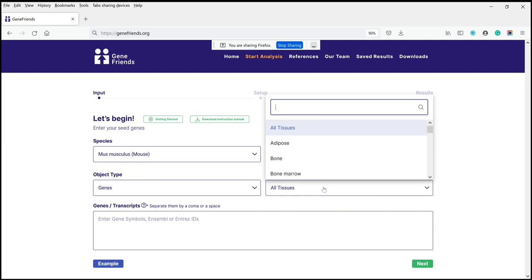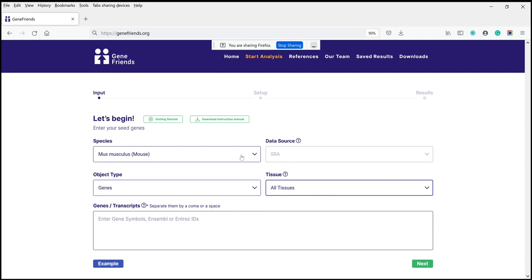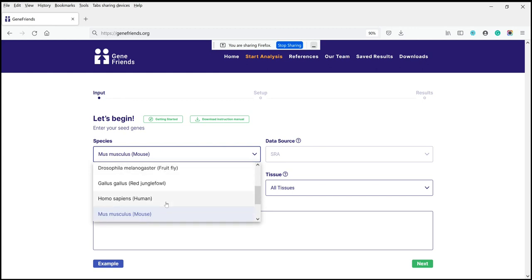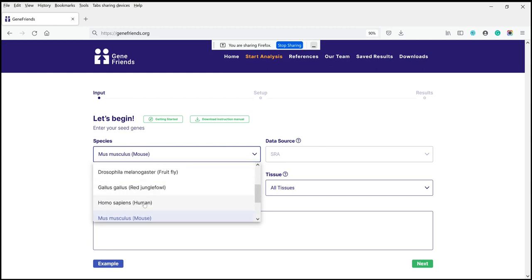In terms of tissues, these are also available for mice as well as for humans, but not for the other species. A lot of data from Drosophila and C. elegans comes from whole organisms, so you have available data for all tissues combined. This all-tissues-combined data is also available for humans and mice.